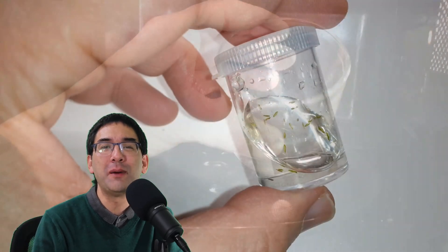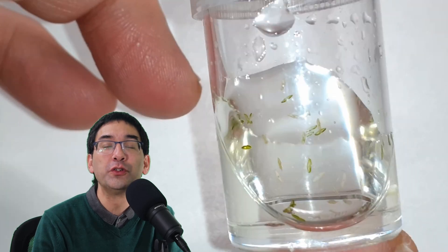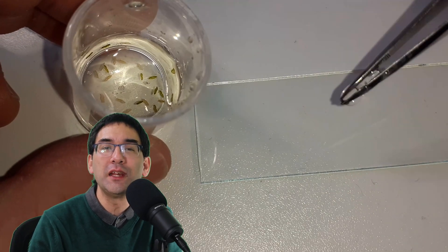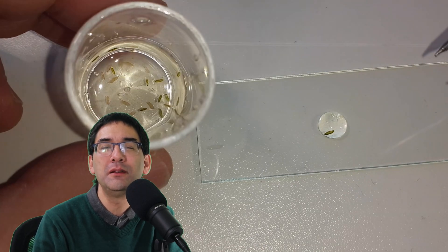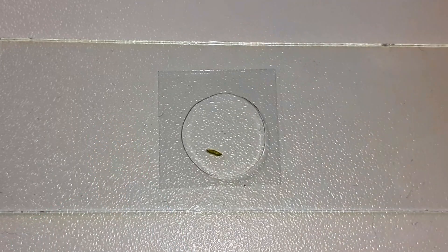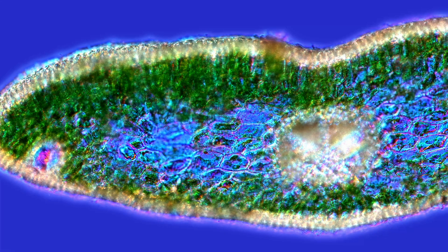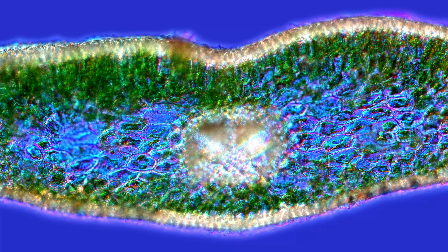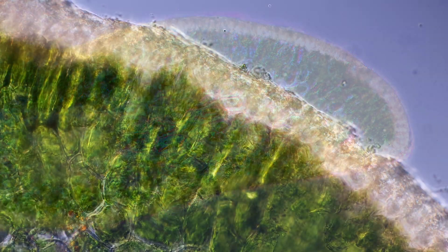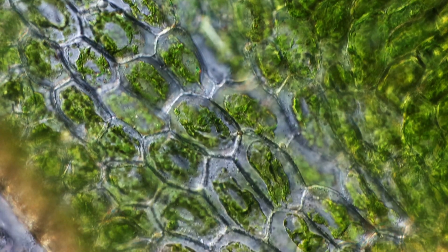With the help of my microwave I made a very concentrated, syrupy sugar solution and placed the sections in it overnight. This caused the water to be removed from the cells and the cell contents to shrink, clearing the specimen quite a bit. Under the microscope I was happy to see this seems to be the best method. You can see many green cells with chloroplasts on the top surface, and in the center the cells are less densely packed. Going further into the leaf, the cytoplasm has shrunk and the individual cell walls become much more visible.